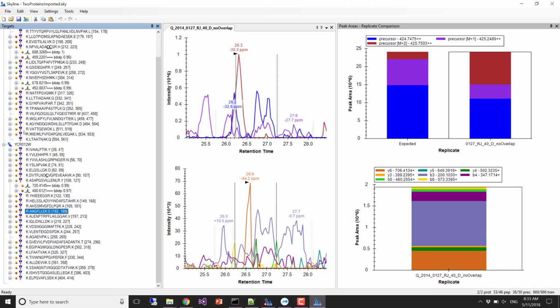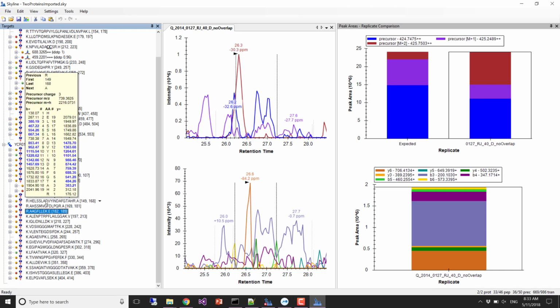And so I showed you that example where we got a library from Biognosys, and the correlation with our predictor was like an R-squared. So it's not, but Mike has shown you that, in our lab, we're doing these now, gas phase fractionation DIA runs to recalibrate the retention time, and then we get a lot of extra power by having extremely consistent retention times, but they're not totally necessary.